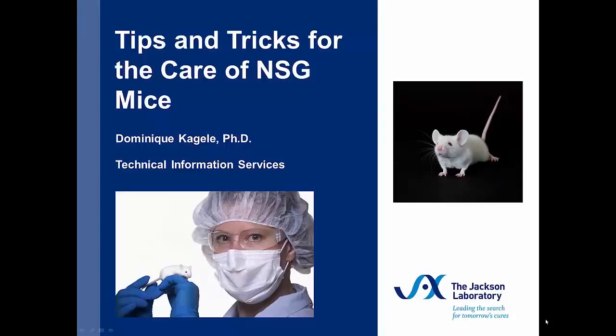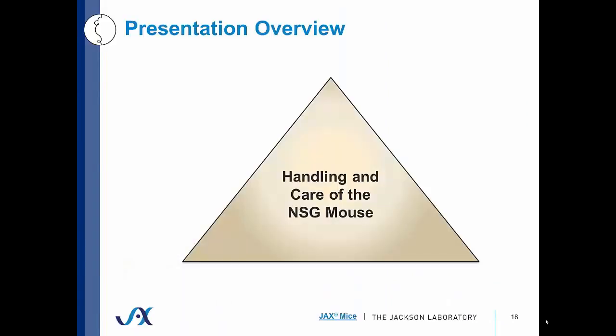Thank you for joining us for our presentation today, where we will be discussing tips and tricks for the care and housing of NSG mice. In today's presentation, we will be discussing some commonly used strategies and suggestions for the care and handling of NSG mice. In order to do this, three really important considerations must be taken into account.